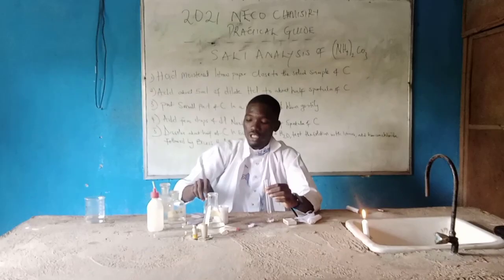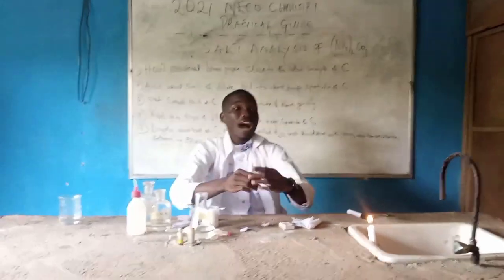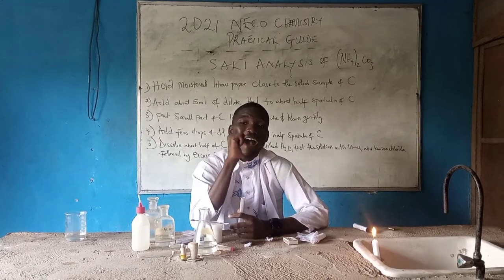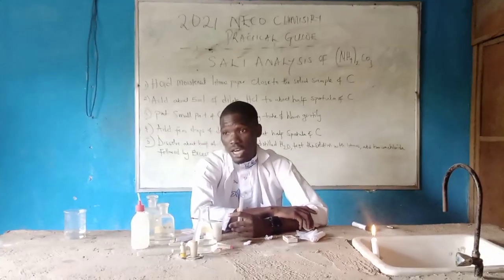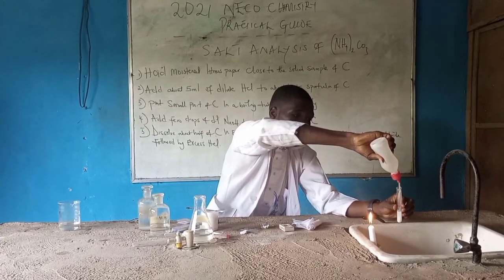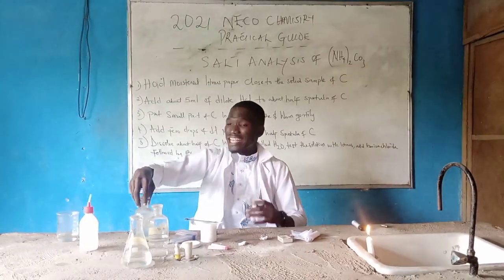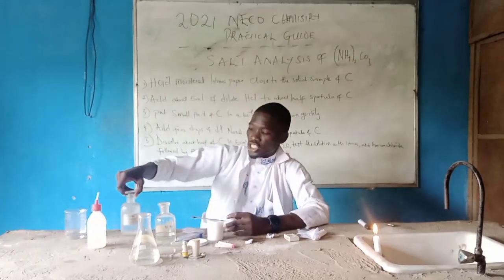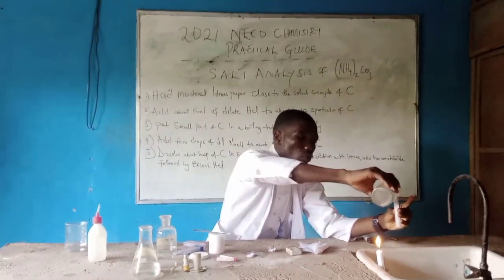We are going to put our sample C into the test tube as usual. Where you have your sample C in the test tube, the next thing is to pour five centimetres of water into sample C. So we have sample C now. We are done using water. Let's move to our barium chloride. You open it and pour a little of your barium chloride into the sample C with water.